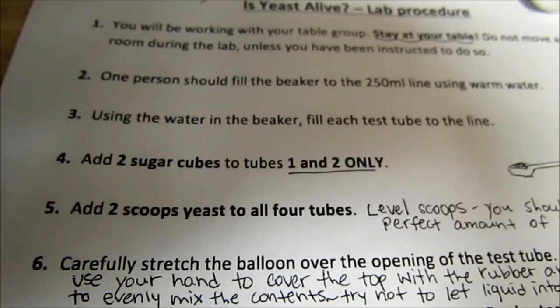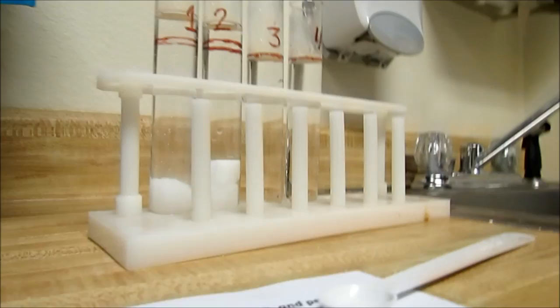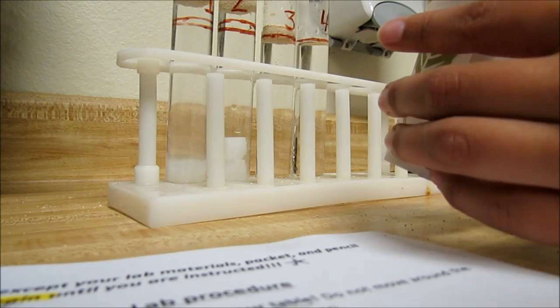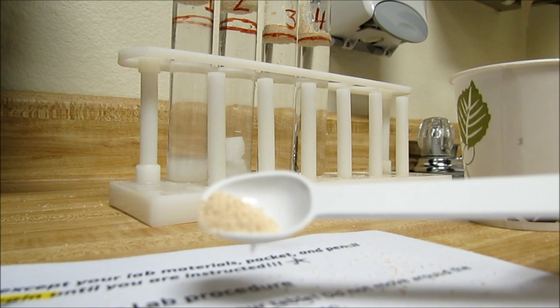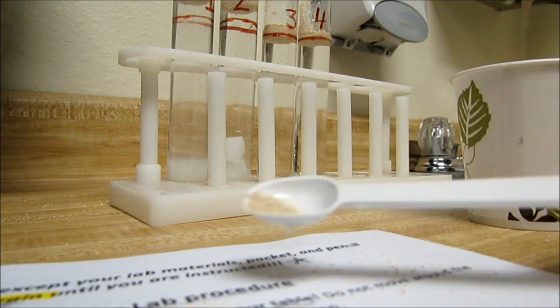Next, it says I should add two scoops of yeast to all four tubes, and I'll be adding nice level scoops, not piled on scoops. So I'm going to go ahead and do that. So, there's a look at what the yeast looks like before we put it in, so you can just see it's little tiny brown grains.